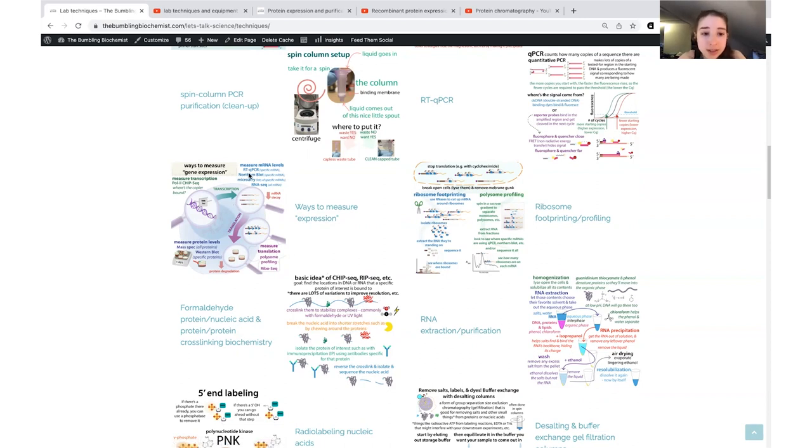You can also do things to measure the messenger RNA levels after the transcription. So this can include RT-qPCR, which we've talked about, Northern blot, which we've talked about, and microarray. This is where you're looking for lots of specific messenger RNAs, and so you have an array. Each well is kind of like a little Northern blot happening, but it's like a well in a plate. And then RNA sequencing, where you basically sequence all of the RNAs that are there.